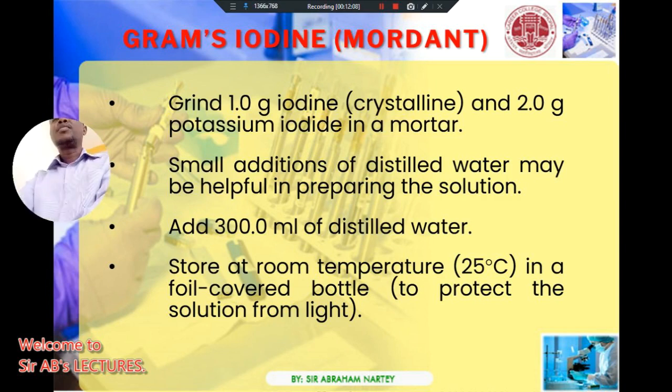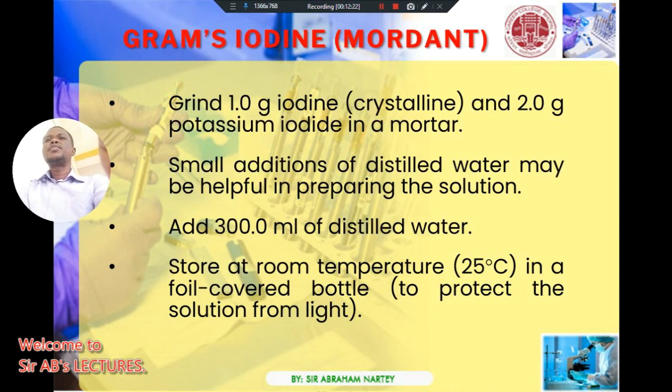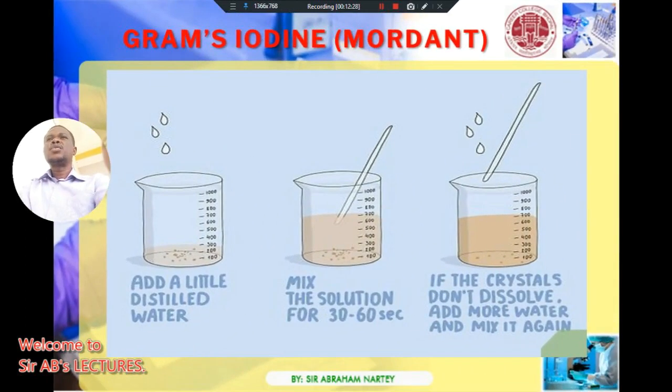Solutions that are sensitive to light, we normally put in those deep brown containers. So after you do this preparation, then it means you are done with the product. So this is the setup of the preparation of the product.